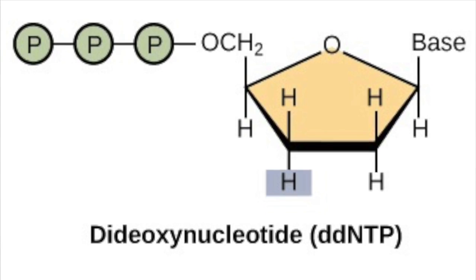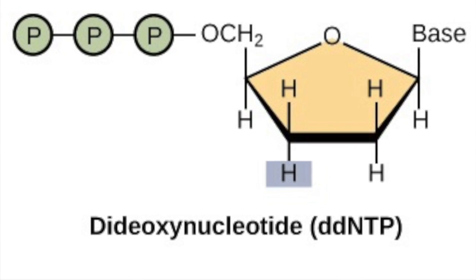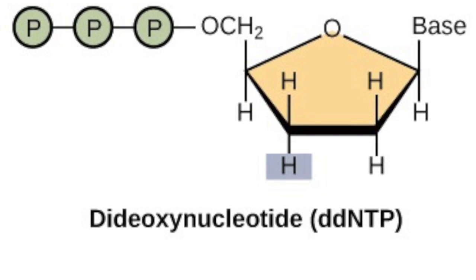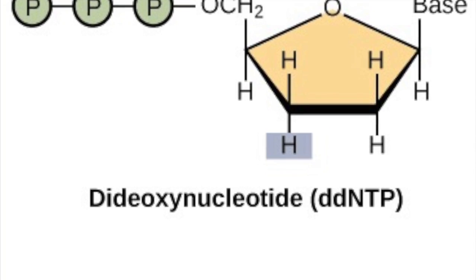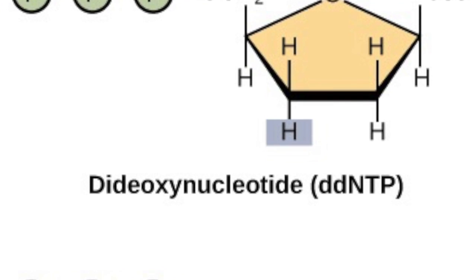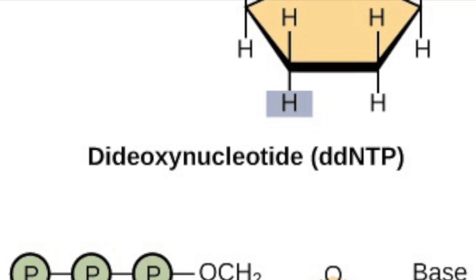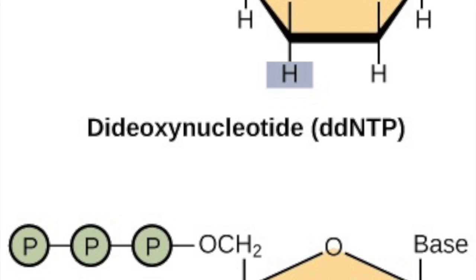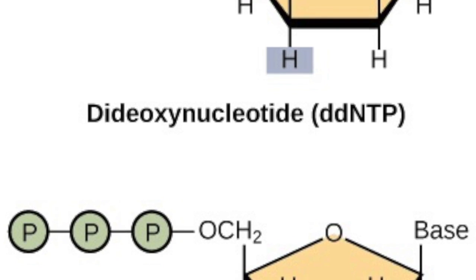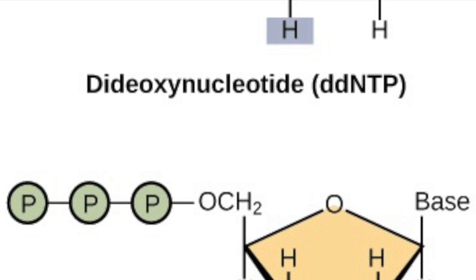Sanger sequencing involves making many copies of a target DNA region. Its ingredients are similar to those needed for DNA replication in an organism, or for polymerase chain reaction, which copies DNA in vitro. They include a DNA polymerase enzyme, a primer, which is a short piece of single-stranded DNA that binds to the template DNA and acts as a starter for the polymerase.